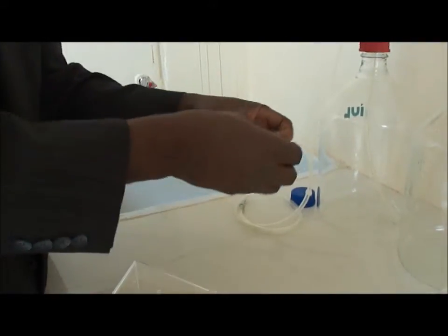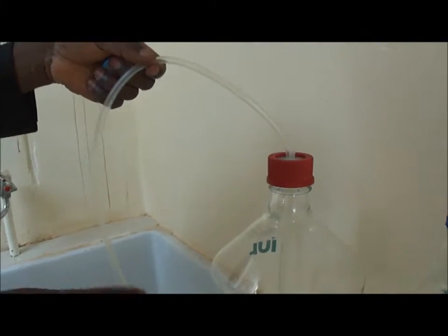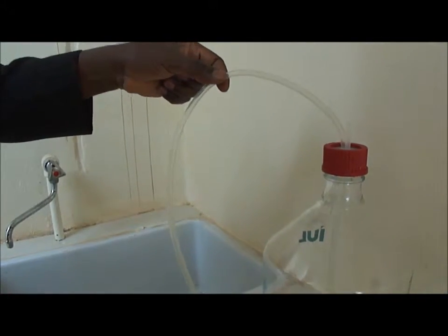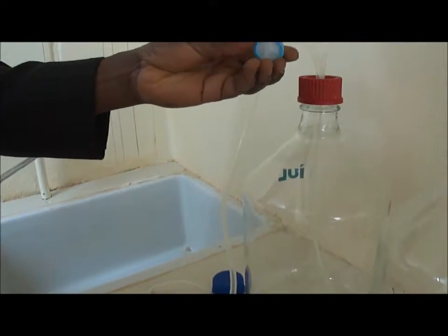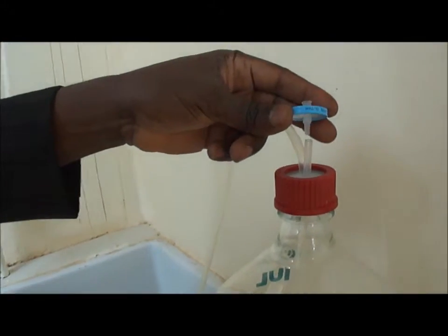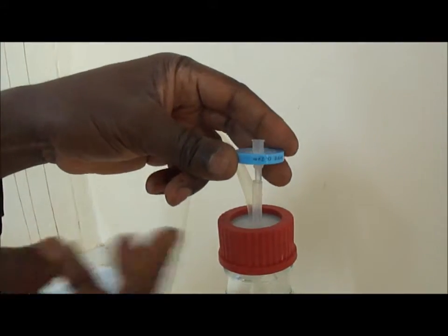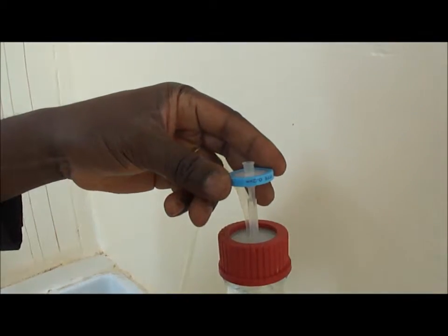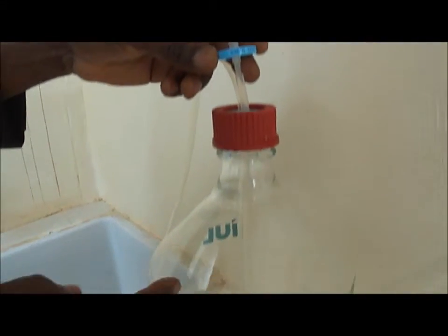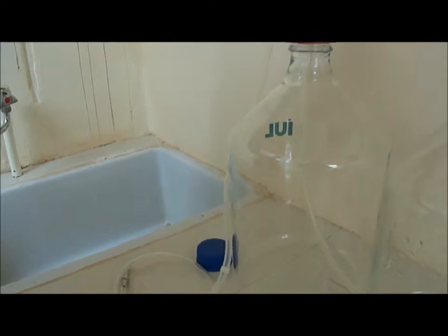But also you have a second pipe here, apart from the main pipe conducting the diluent out of the bottle. You have these small filters, air filters, that will be mounted on the pipe extremity left, in order to filter the air, to allow the atmospheric pressure to enter into the bottle when the diluent is being pumped out.